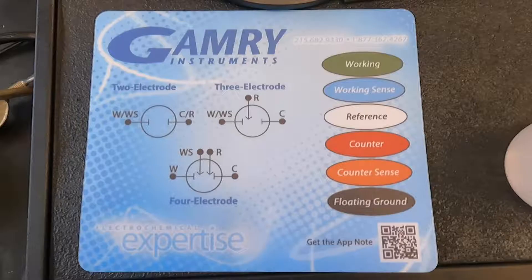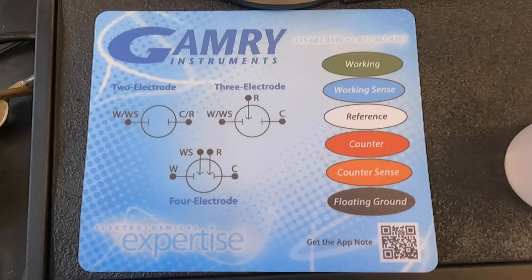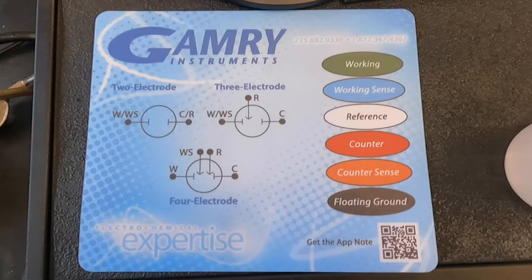Hi there, my name is Ryan and today I'm going to teach you how to set up the Gamry for cyclic voltammetry. This mousepad has all of the different diagrams and a reference for the colors of the different electrode leads. Feel free to pause if you want to read that.